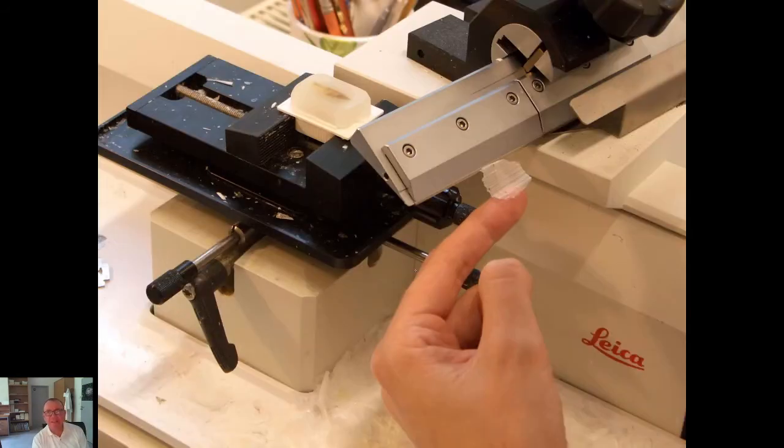Here is a detail of the work in a sliding microtome. You can see a tissue block here. Some tissue is inside, I don't know what it is, some organ probably, some piece of organ. The laboratory assistant made the sliding movement of this blade along the surface of our block, and the section is here.